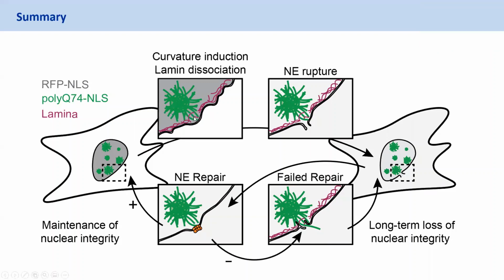Yeah, I wondered physically, by intercalating. My only suggestion is if you could simultaneously image the nuclear lamina, like lamin B1 or A, dynamically and at the same resolution, I think that would be a fascinating way. Yes, we have done it, it's in the manuscript, but we haven't done it at super resolution, only with normal live-cell imaging. There you also often see transient accumulations, and you also see scarring. Sometimes when there has been a rupture, you see a scar, a massive accumulation of lamins.